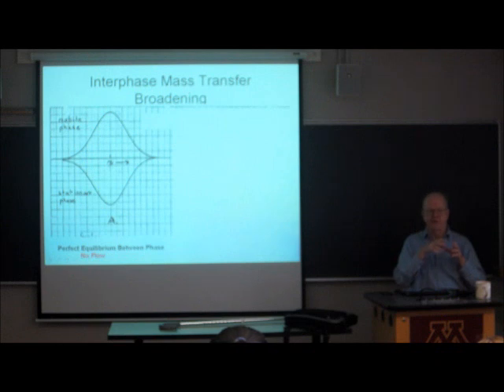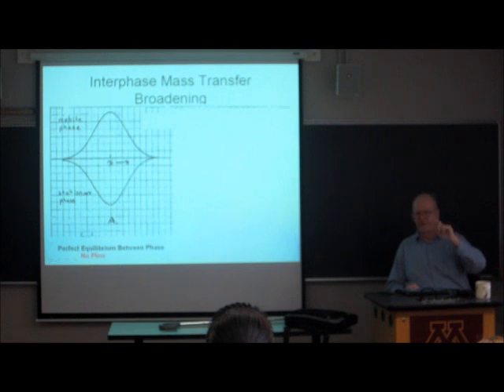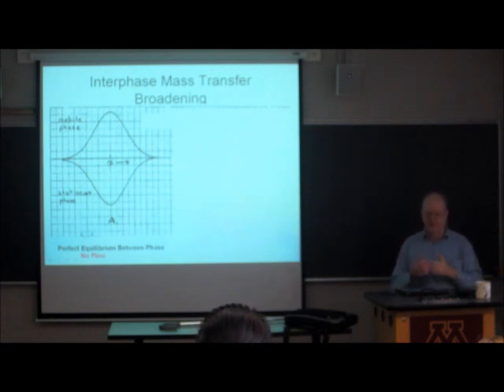Because as the solute molecules are going down the column, they are continually adsorbing and desorbing many, many times. And the speed with which they can adsorb and desorb is related to the kinetics of the mass transfer process between phases.